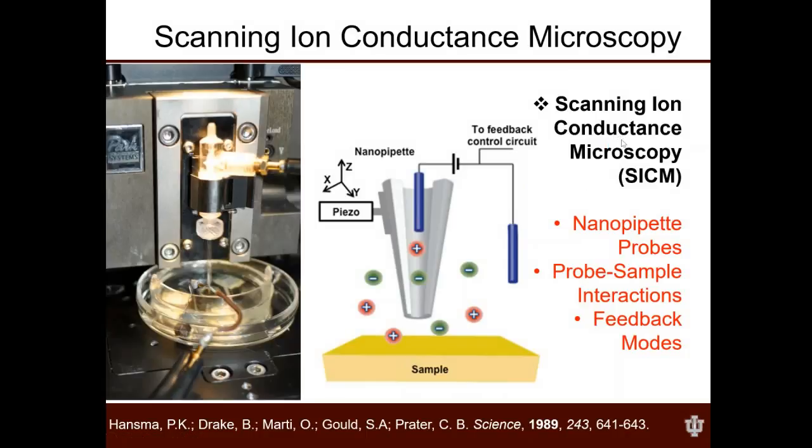Now, this in the middle is a cartoon of SICM. On the left is the actual SICM instrument. So the pipette shown here is the pipette here in the image. It goes into this holder that holds the pipette. This electrode is connected through this external wire, and then the counter electrode is this silver chloride electrode that's here in this bath solution on the exterior. The piezoelectric positioner is shown here, the pipette's mounted to that, and then our sample in this case is at the bottom of this petri dish. So everything's in situ in this measurement.